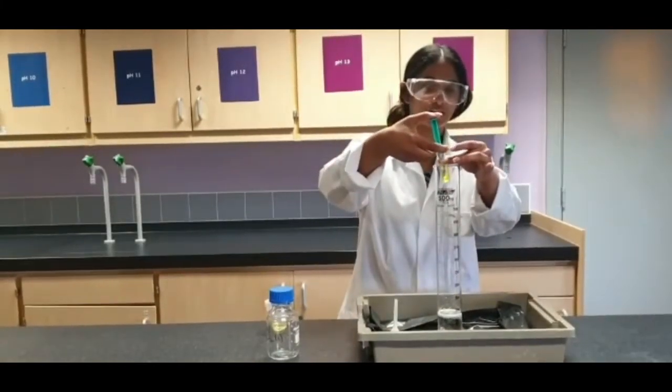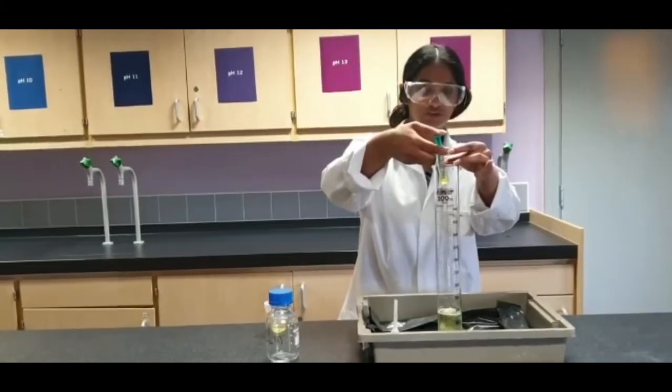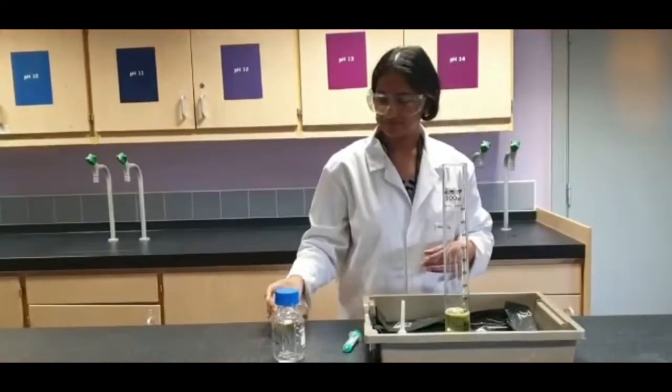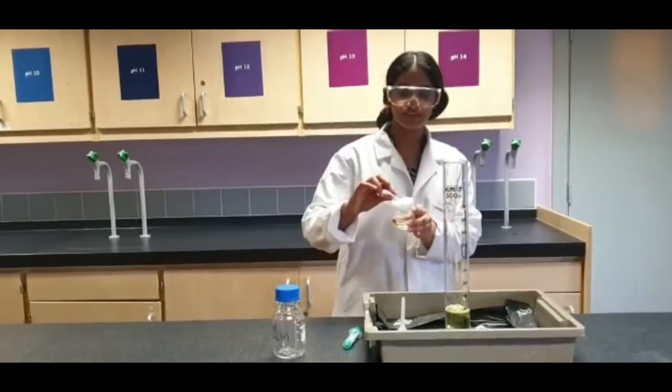And pouring the washing up liquid into the hydrogen peroxide. And lastly, the potassium iodide.